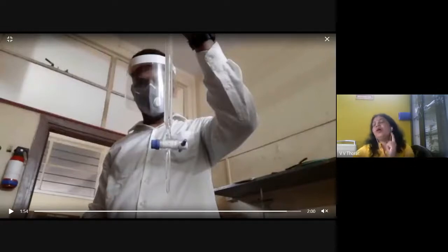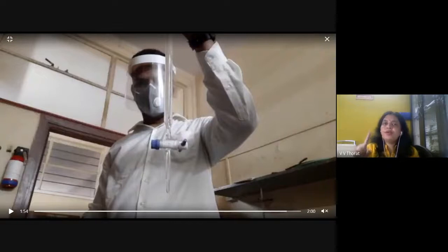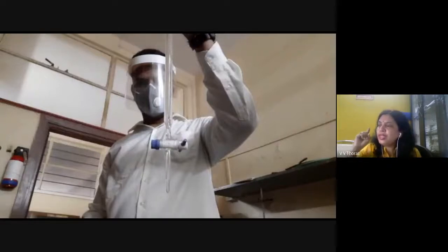You should know how to fill the burette, because in the exam, a difference of plus or minus 0.3 will only get full marks. If you don't fill the burette properly, error will be there, and again you will lose marks. If the expert reading is 15.2, then 14.9 to 15.5 will only get full marks, and then gradually marks will be deducted.